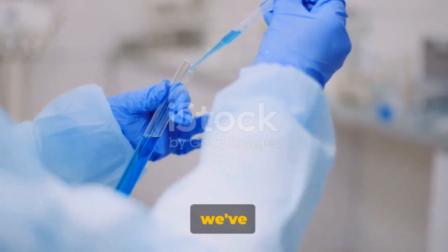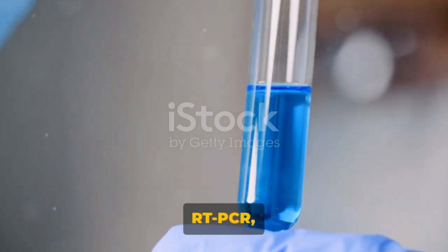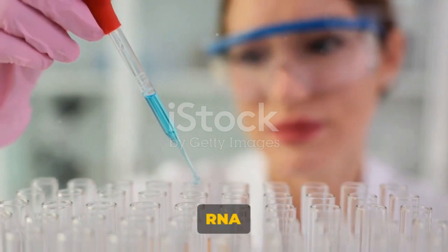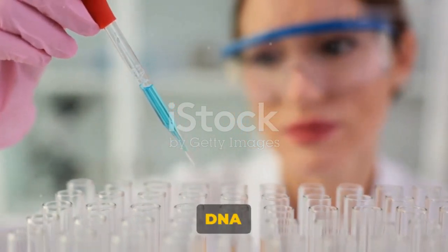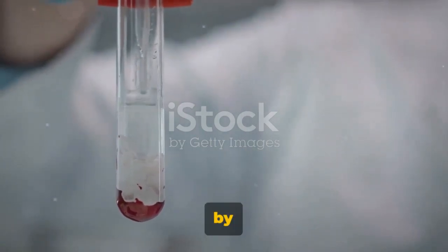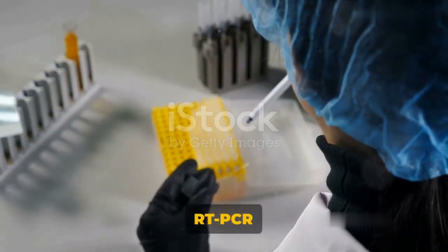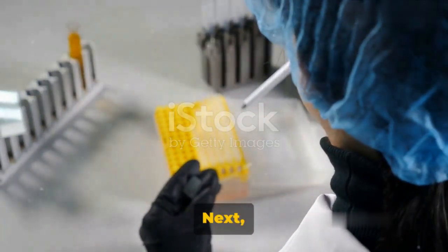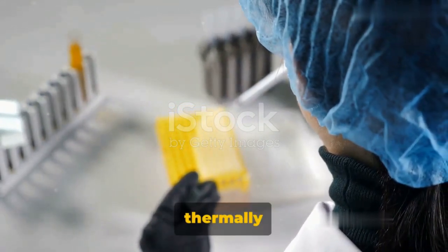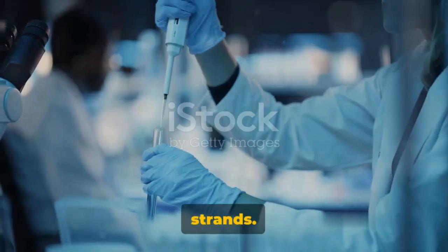Let's quickly recap what we've learned today. We started with the nucleic acid sample, which in the case of RT-PCR is RNA, primarily mRNA. This RNA is converted into complementary DNA or cDNA before amplification. This conversion is facilitated by the reverse transcriptase enzyme, a vital component of the RT-PCR process. Next, we discussed the DNA polymerase enzyme, particularly the thermally stable Taq DNA polymerase, which synthesizes the complementary DNA strands.